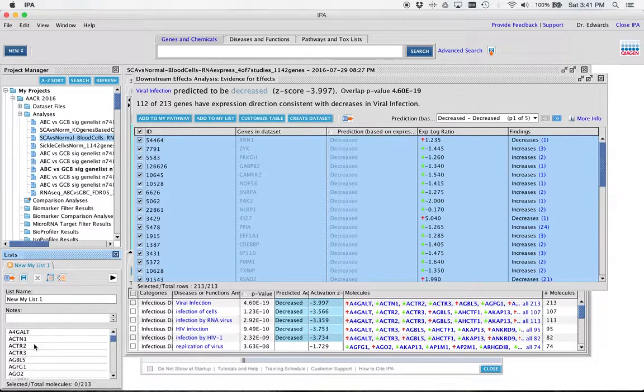Okay, oh, there it is. Viral genes. Maybe you can look at this. We can actually make a subset using these genes, and I can actually analyze just this.